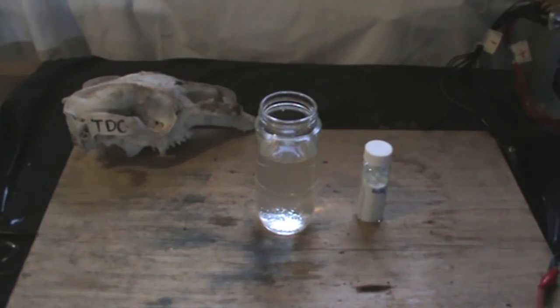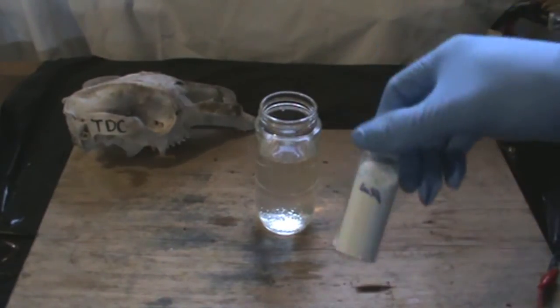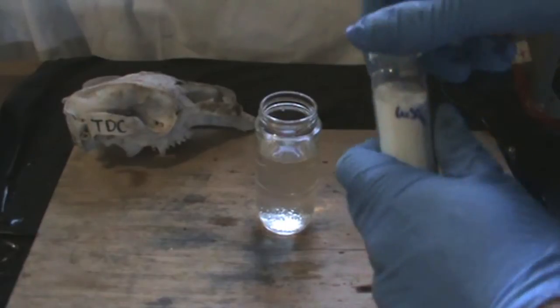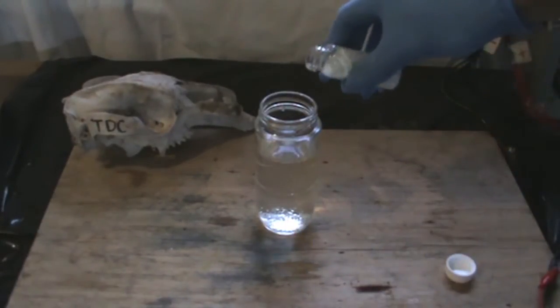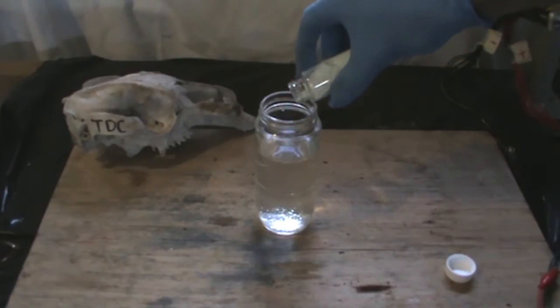To start, get the container holding the water and pour in the copper sulfate, making a saturated solution of copper sulfate. It will take a while for everything to dissolve, so I'll skip over that part.